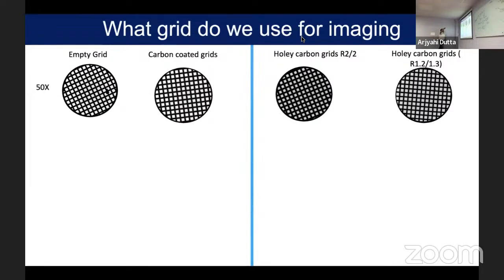So here you can see how we can use this electron microscope. Now probably you guys will be a little bit happy that he is constantly talking about the magnetic lens. So how can we prepare our sample? There are different types of grids available, but in most cases the grid diameter is 3.05 millimeter. Now there are two types of microscope we can mainly use nowadays.